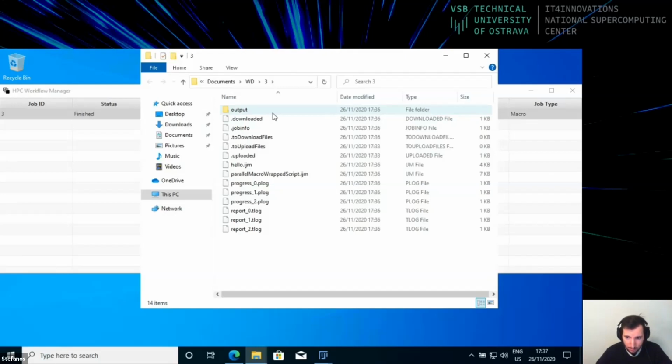In this script, we have placed the output in a different directory called output, but this is just in our script. The output is usually placed in this folder, and if you notice in the path of this directory, you will see that it is using the working directory as specified in the previous configuration step, and then it generates this directory. In my case, it is 3 because it's the ID of the job. Yours should be 1 unless you have run other jobs previously.